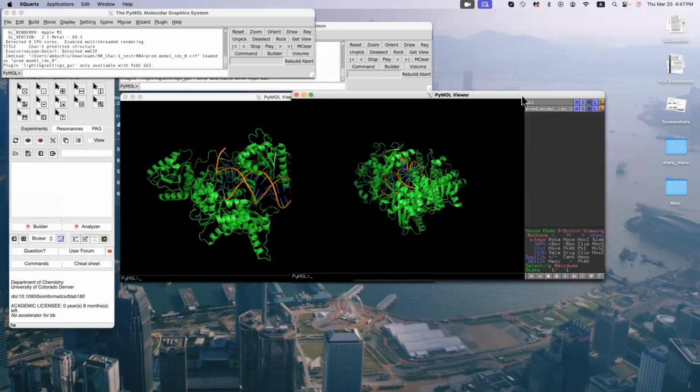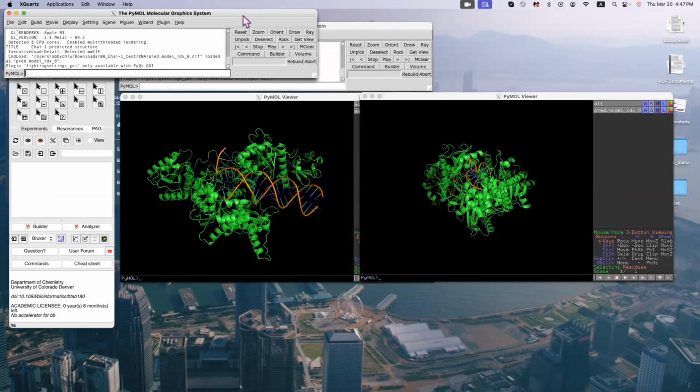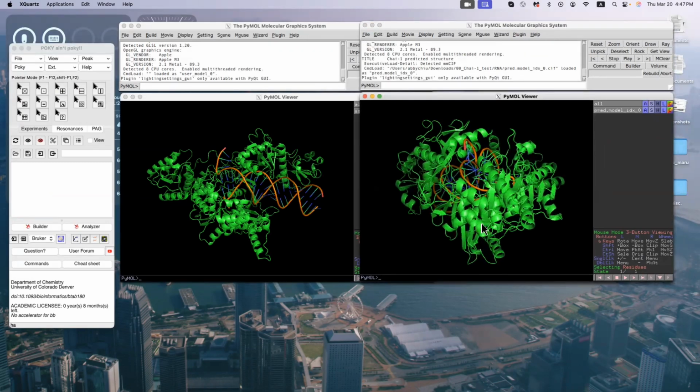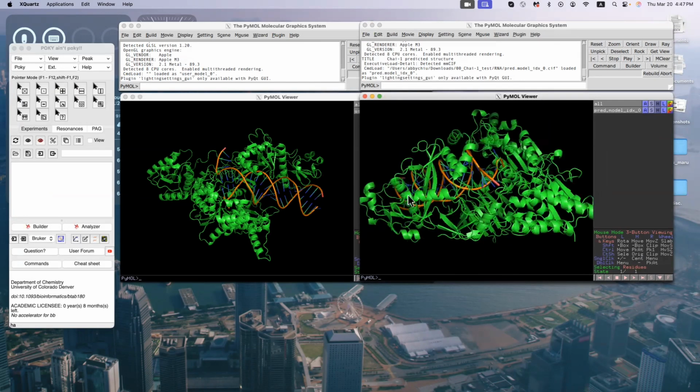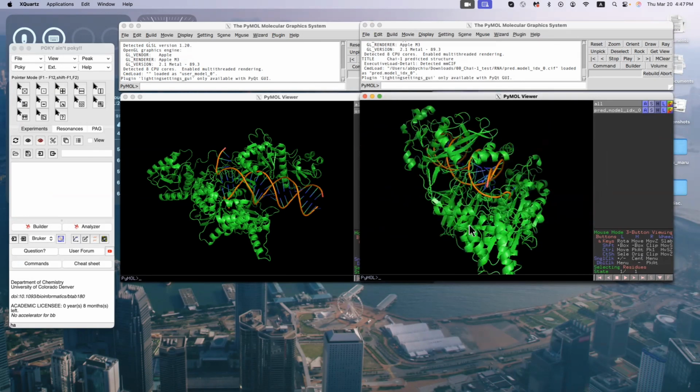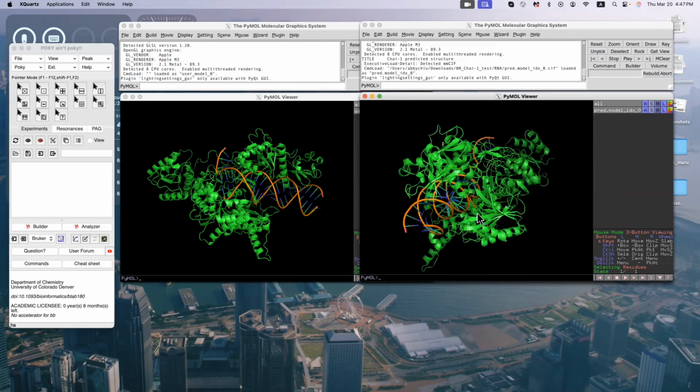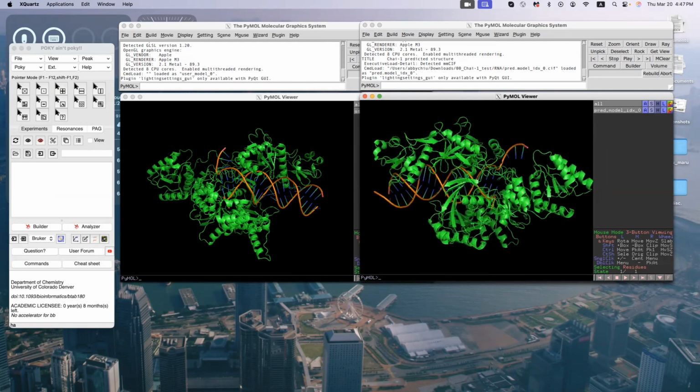And so this structure on the right here is the one from Chai-1. Let's zoom in. You can see your RNA, your proteins. So this is the structure of the 8IFK in the PDB.